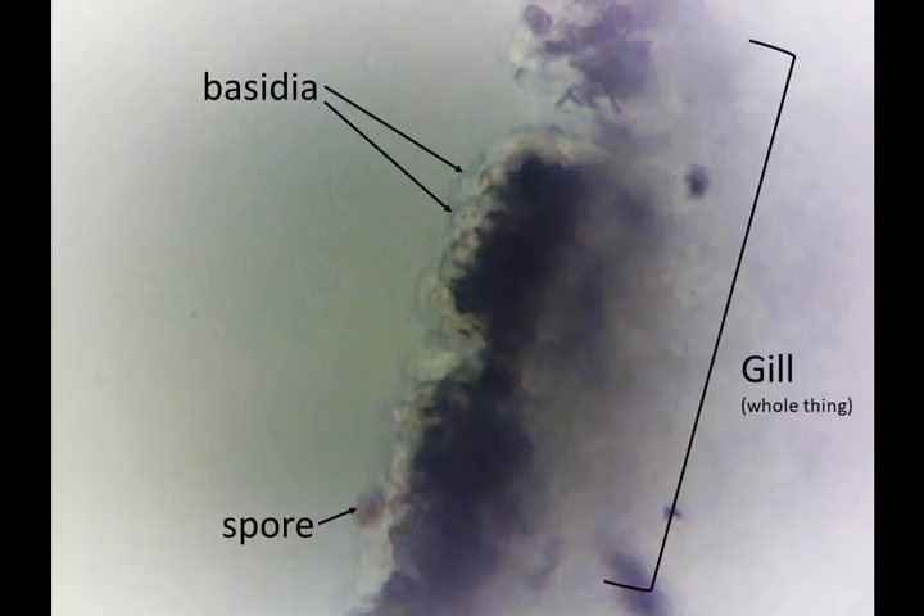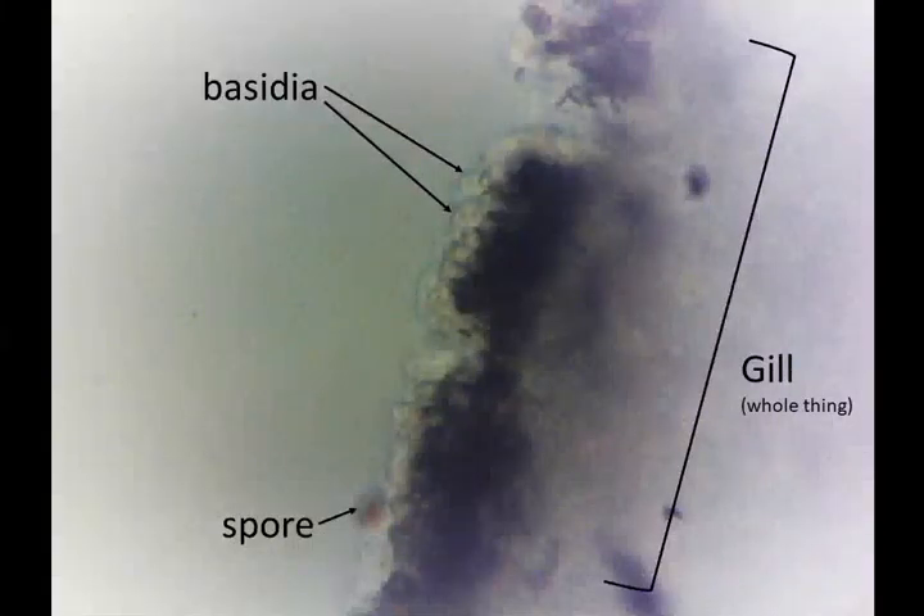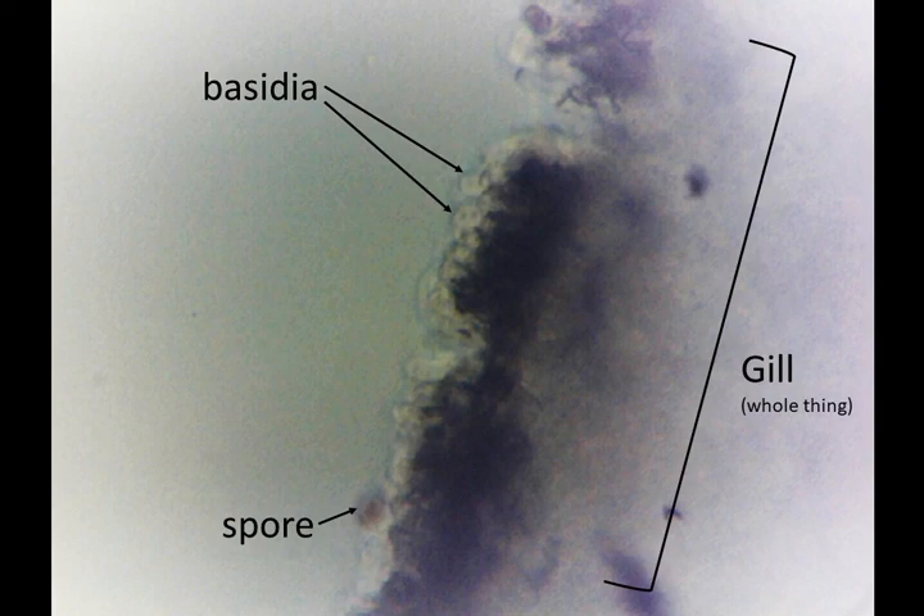Here I have a picture of what I found in the microscope with everything labeled. The gill is really the whole portion that we're looking at under the microscope. The basidia are those finger-like projections at the bottom of the gill, and they produce spores. I can find one spore on this slide — you might not be able to find any, so you don't need to label them if you can't. And that's the end of our lab today.